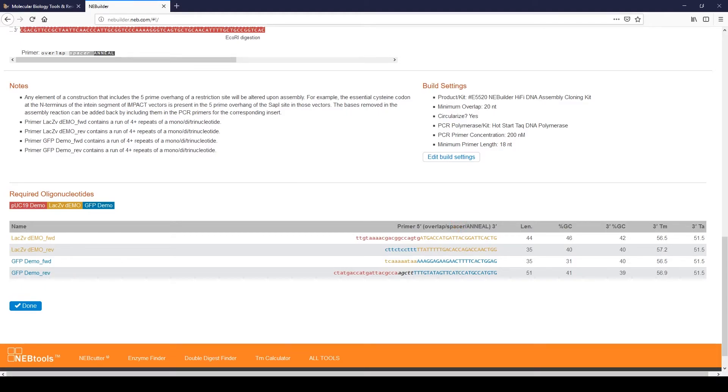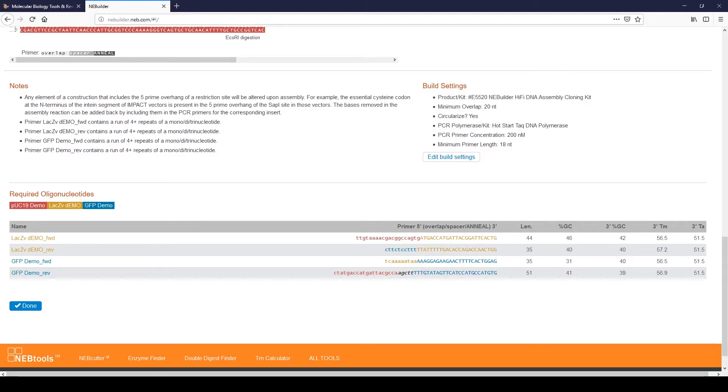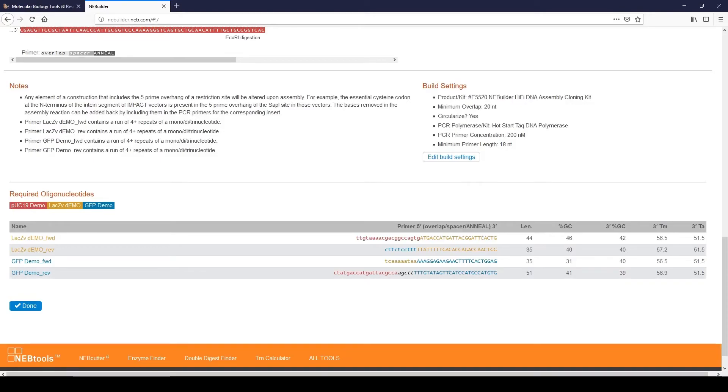The GFP reverse primer also contains the sequence AGCTT, which are the bases added to the primer to restore the HINDI-3 site. The TM for each primer and the predicted annealing temperature are all shown. The annealing temperature is calculated for the specific polymerase chosen in the first page. Click Done.